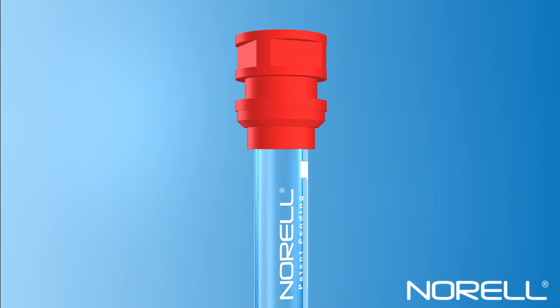The edge of the security band also denotes a stop position for partial, temporary cap placement, allowing quick and easy access to the NMR tube.